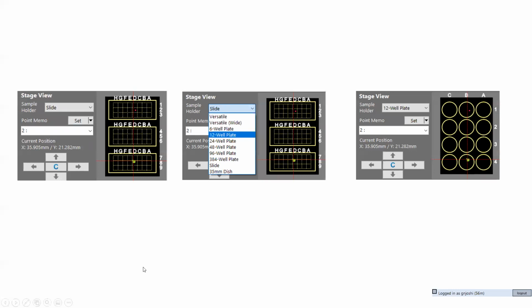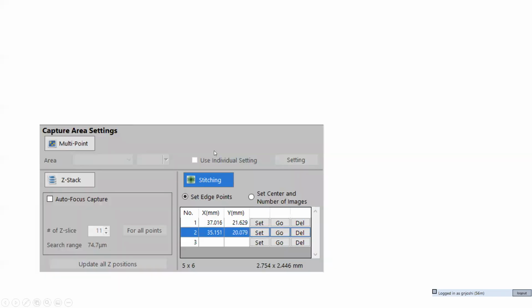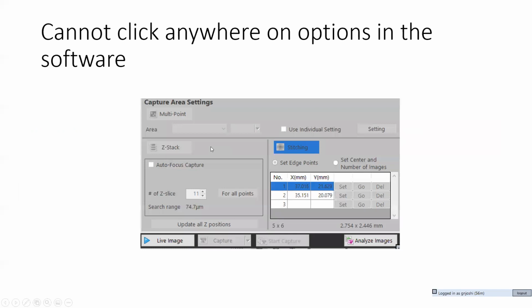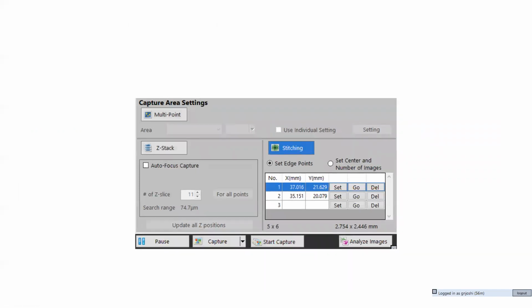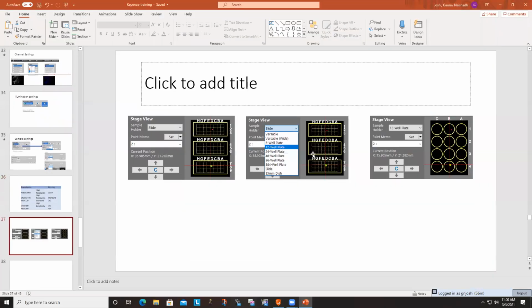And when we go to the stage, we have a bunch of options with stage. You can change the layout and template the way you want to. Okay, so these are the things I wanted to talk about really quick. And I will in fact show you all these things instead of going round and round. Okay, so let me jump onto putting a slide and show you a slide real quick.